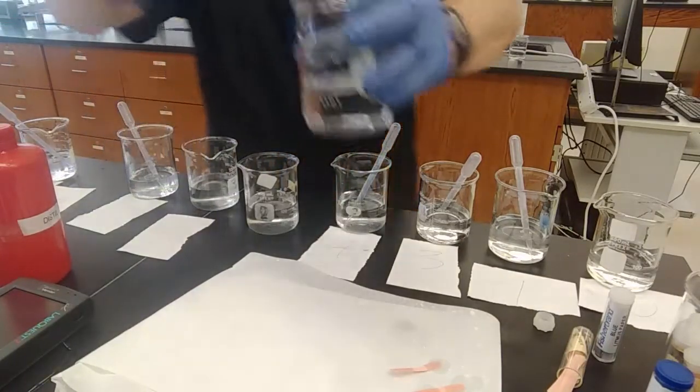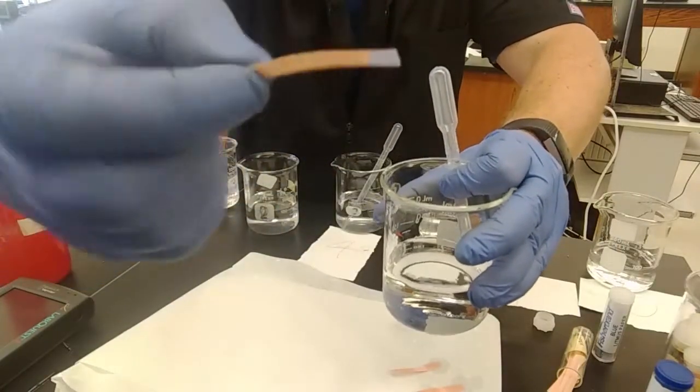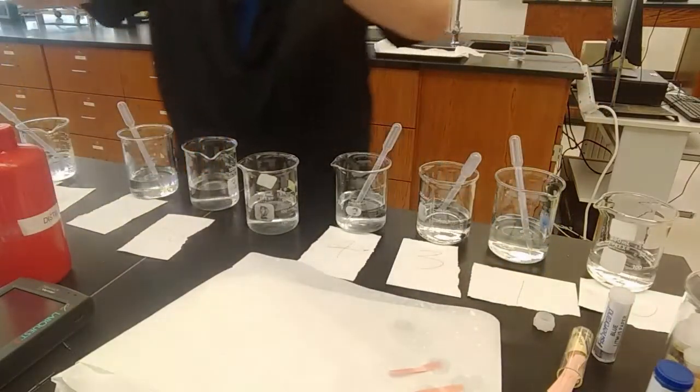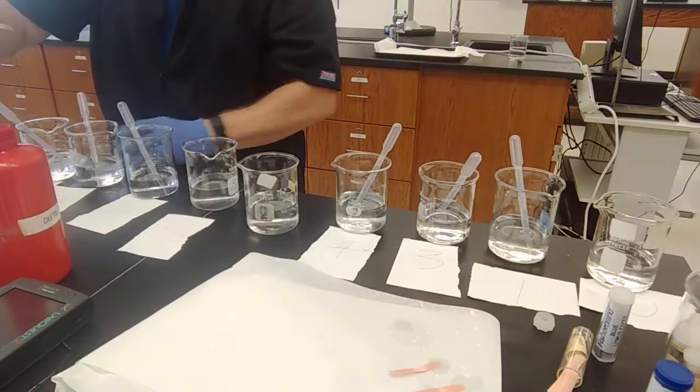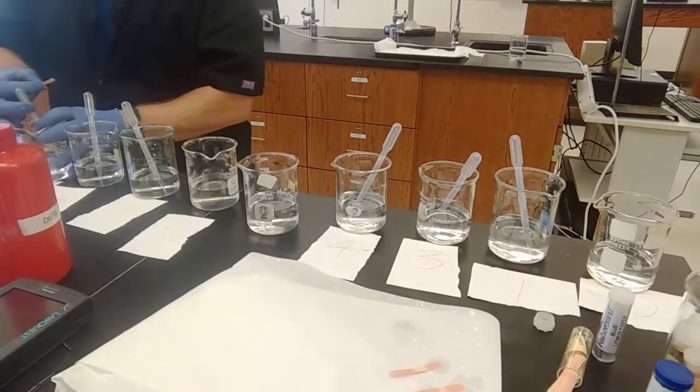So pH 13, red litmus paper, blue, definite change. Now all litmus will tell you is acid or base. Doesn't tell us the exact pH. Let's go for 14, which we know is more basic.